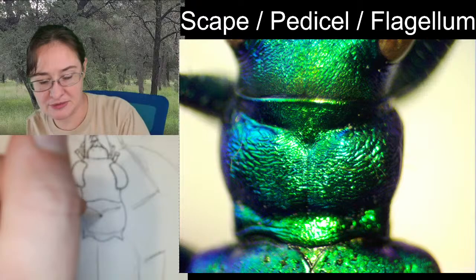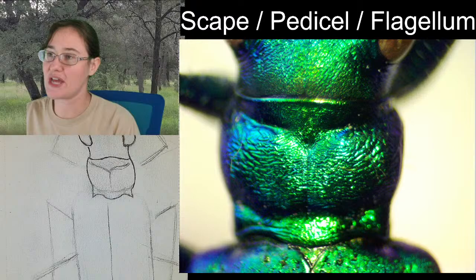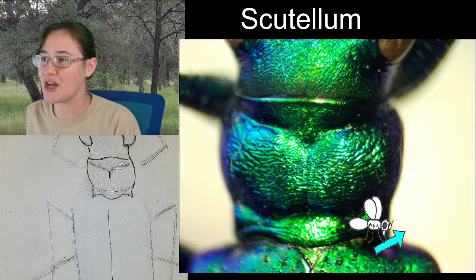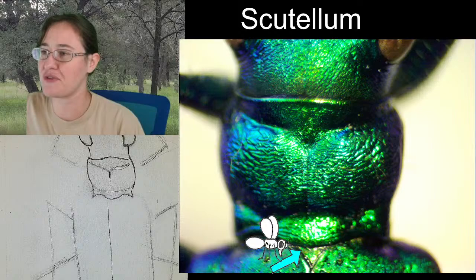When we're coming down from the pronotum, actually right here in this image, it's pretty easy to see what we call the scutellum. So let me change these words up here for us. If we're looking at the scutellum, it is right about... Oh, come on, Terry. Fly away. He says, no, I don't want to fly. Here we go. All right, that little triangle right here that's central and in between the elytra, or in between the front pair of wings, that is what we call the scutellum.